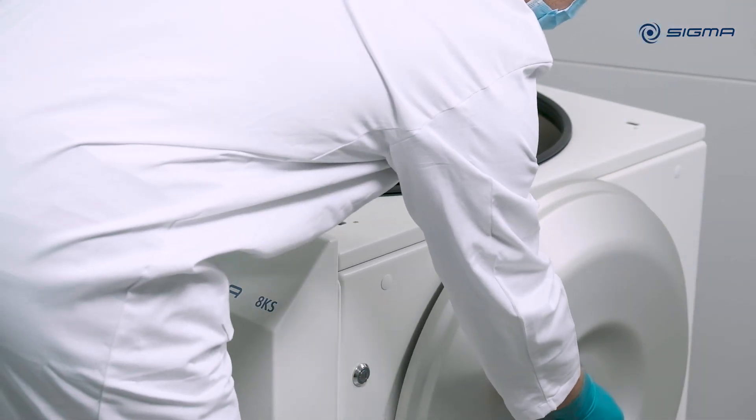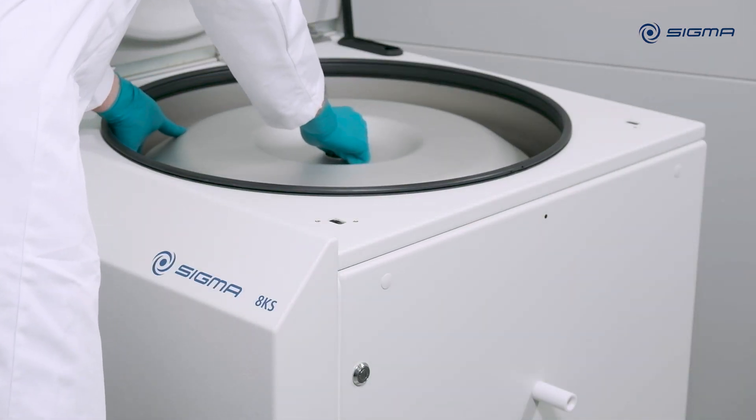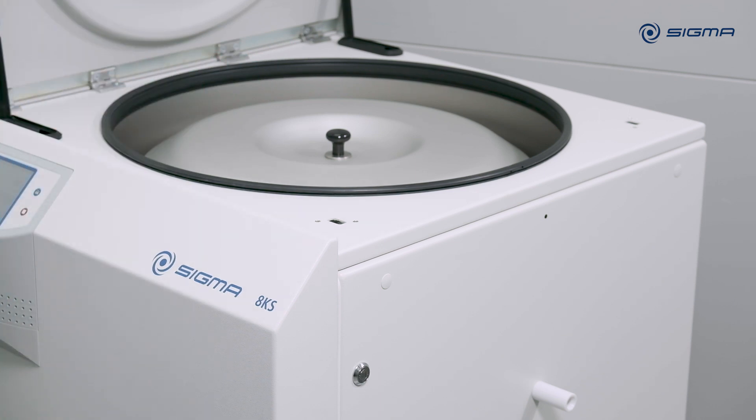Sigma 8 KS rotors are optionally available with a windshield. A rotor with a windshield has substantially lower energy consumption and allows higher RCF values.